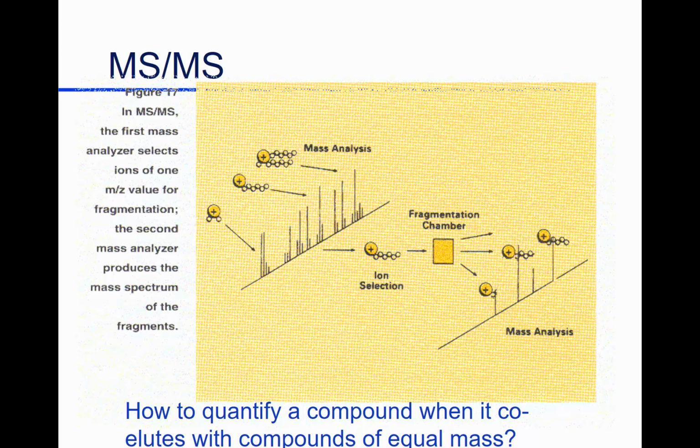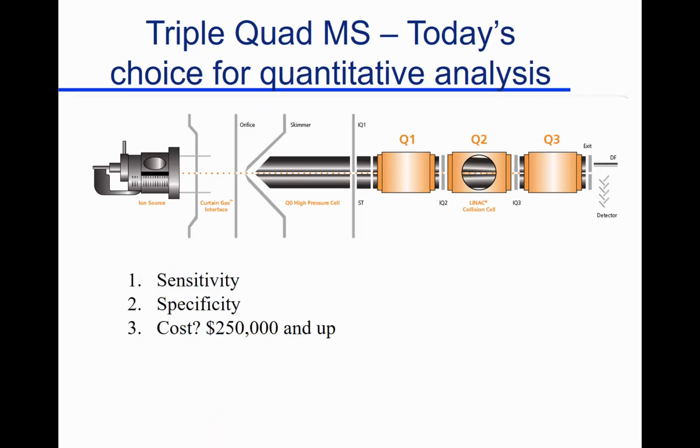It's called MS/MS, where you do mass spectrometry, and then you take some peak in that spectrum, and then we'll bombard it again to get a mass spectrum of a part of the mass spectrum. That will make sense, hopefully, if it didn't. And so, again, let me take a look and see.